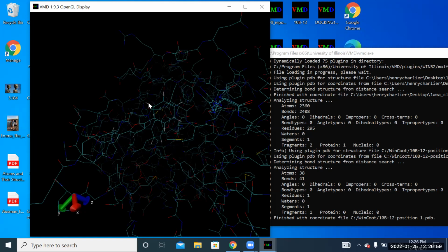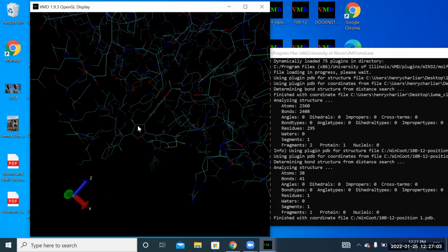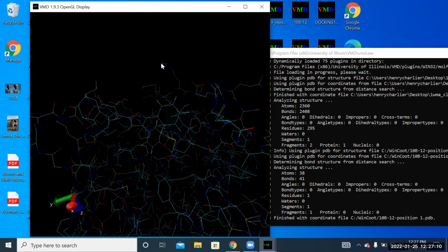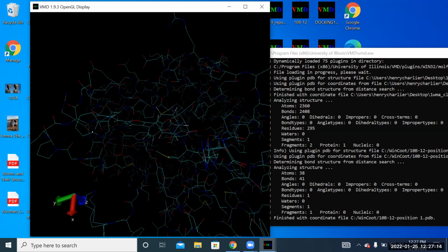hydrogens. The whites here are hydrogens. These were calculated in when I did an energy minimization of this molecule. Hydrogens do not show up typically in X-ray crystal structures, and so none of these are showing the hydrogens.